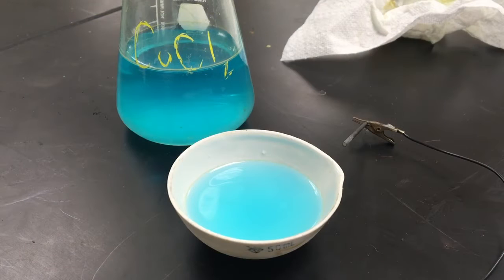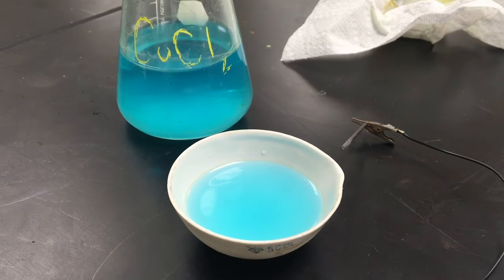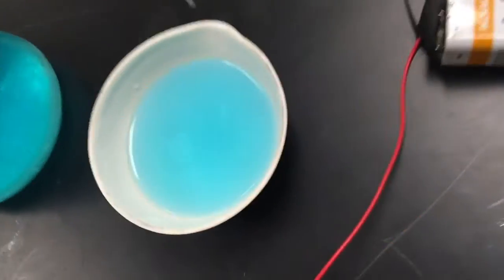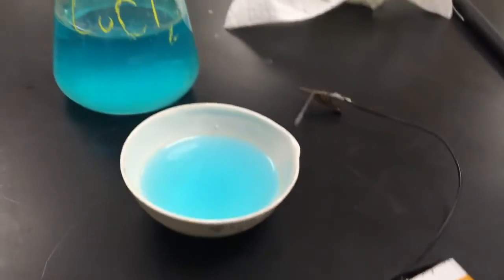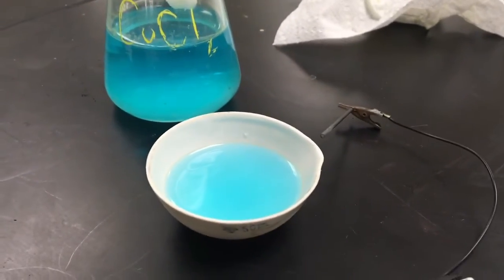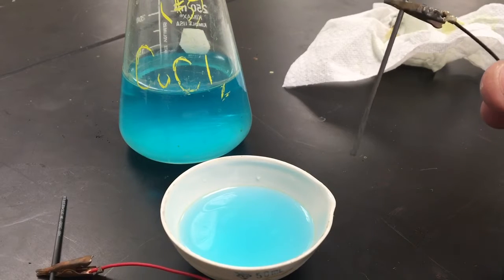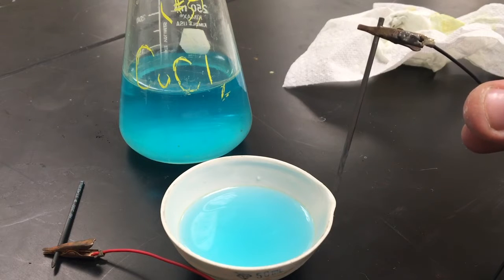All right, here at station number 5, we've got some copper chloride solution that I've already poured into a little evaporating dish where we're going to be doing our reaction. You might be able to see it better in there than in the Erlenmeyer flask anyway. And the only other thing that we're going to be doing is putting these little electrodes into this solution. There's 2 of them. And then watching it react.